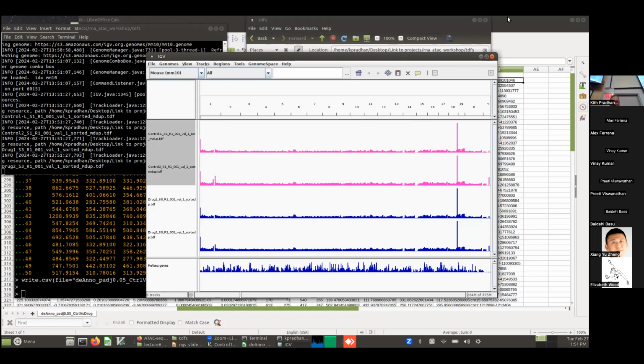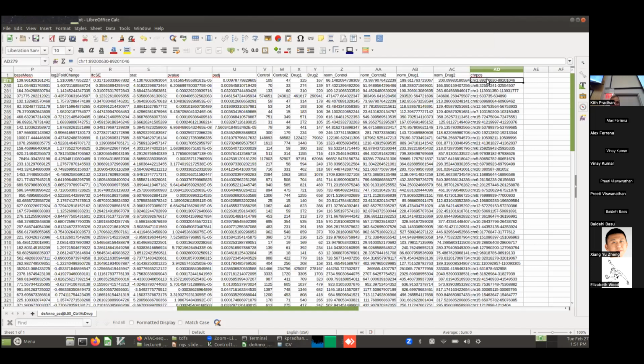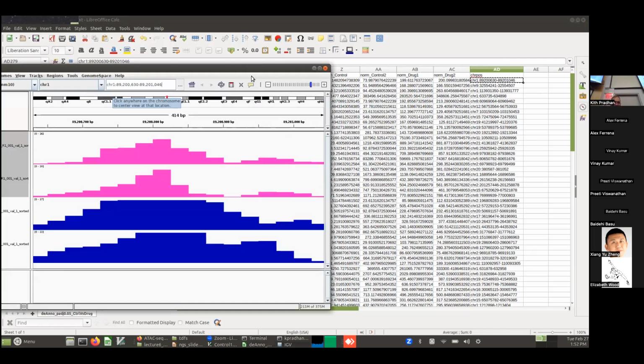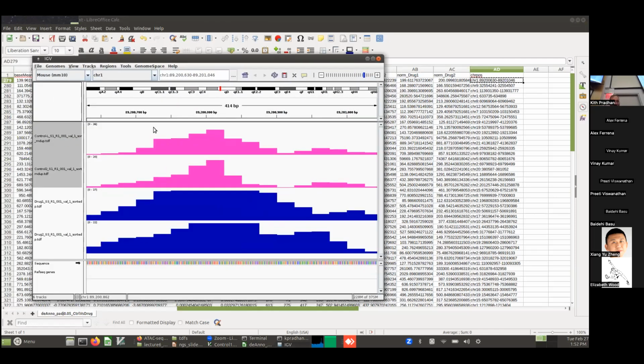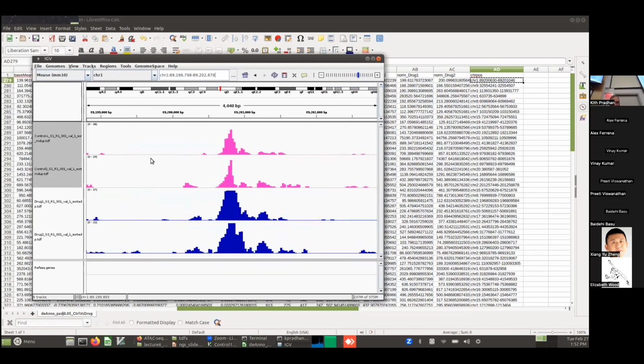The good thing about this is that you have these results. I'm just copying the chromosome position of this significant result. You can actually see the raw counts. You can see that the drug treated samples have higher counts in this peak region, so when we visualize this, the drug treated samples should have higher peaks in this region. So you can copy that, go right to this text input for the chromosome position, and it'll zoom you right to this area. And I like to zoom out.